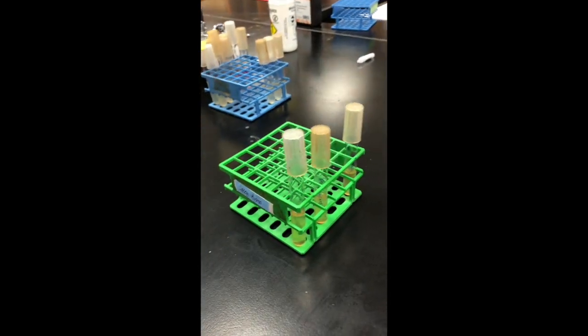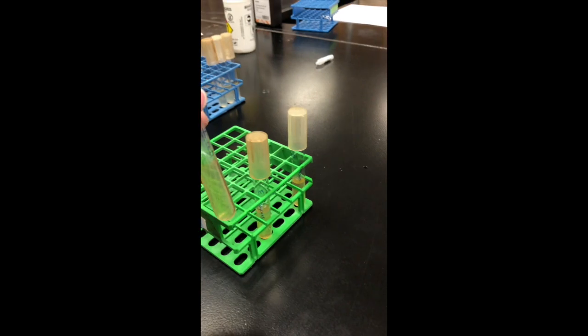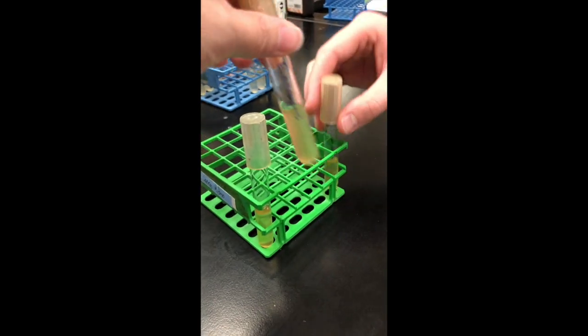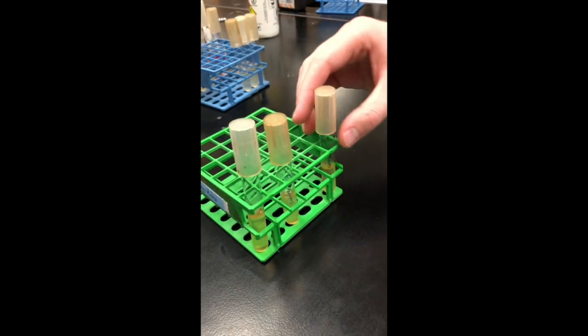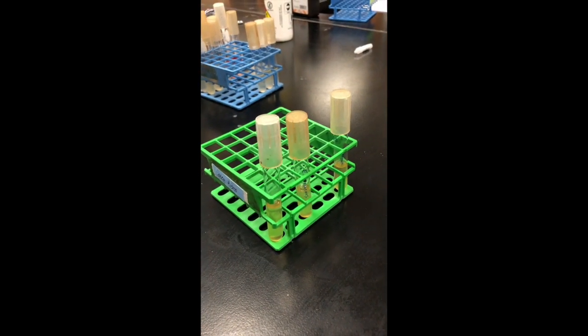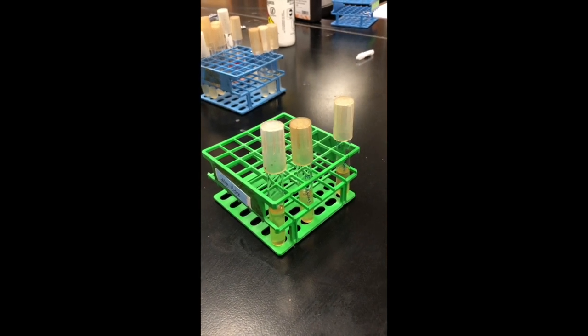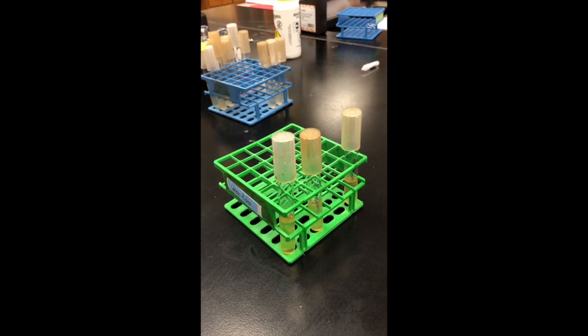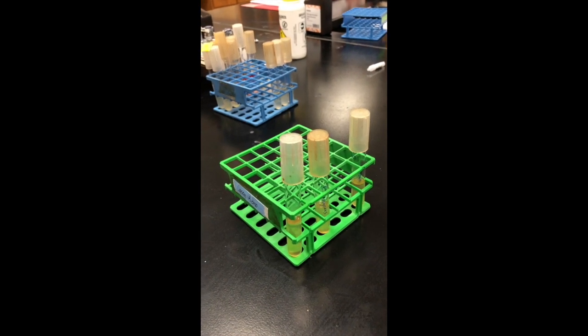Now that our reagents are added, we're just going to gently shake them just for a little bit, just to make sure that they're mixed. And now we're just going to let them sit for 10 minutes. So we'll come back and check on the MR, the VP, and the nitrate in just a little bit. Next, we're going to move on to catalase and oxidase.